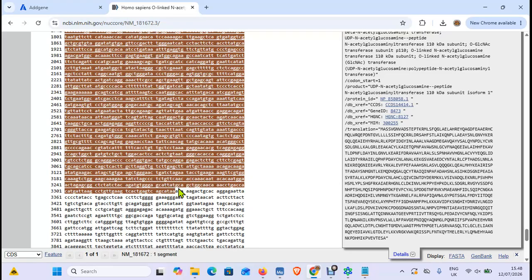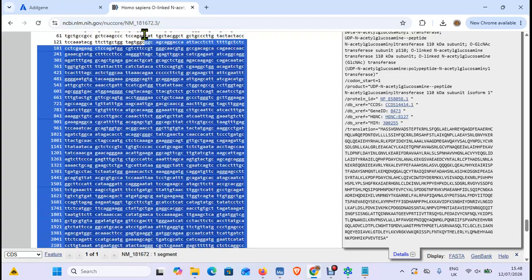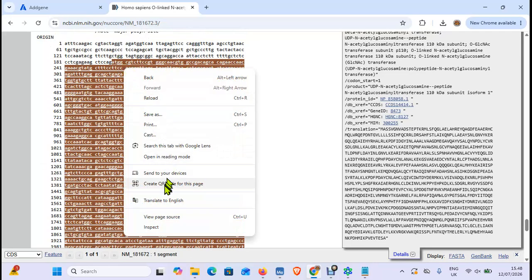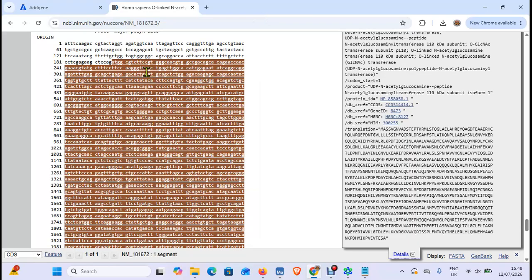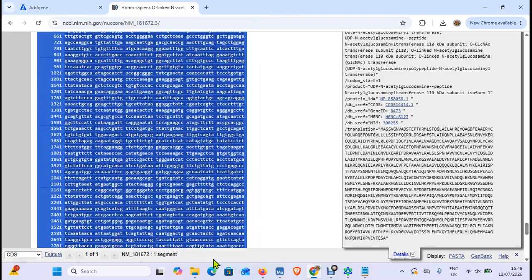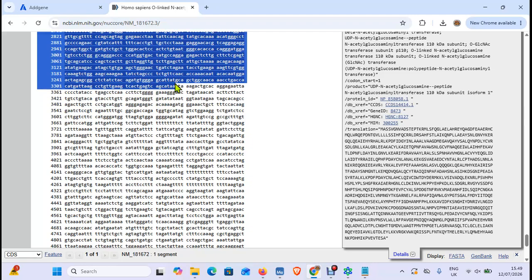So all we need to do is, well, I say all, it's a simple enough task, start selecting all of the brown section and nothing more, and then I right click to copy, and typical. Where is copy? Okay, that's just weird. So in that case, I'm going to highlight, as you can see, this was all filmed before a studio audience, so select, and I will just Control C. I was trying to make it as visual as possible, but there you go.